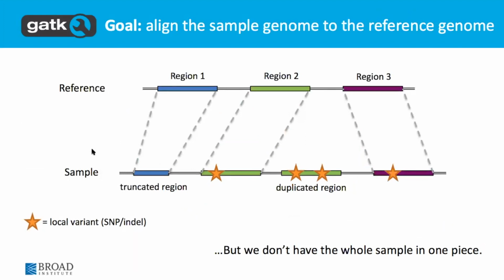When you're mapping your reads to a reference, sometimes it's as simple as being able to tell which region a read is coming from, for example, in region 1 and region 2. There might be some local variants, but the aligner still knows which region it's coming from. In some cases, in your samples, you have duplicated regions, and that's when it gets complicated. In simple cases, it directly maps the reads and gives a high mapping quality. In cases where it's confusing which reads come from a particular region, the mapping quality drops.